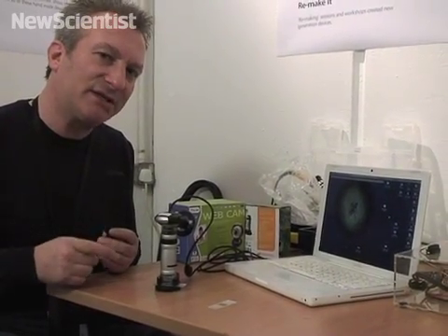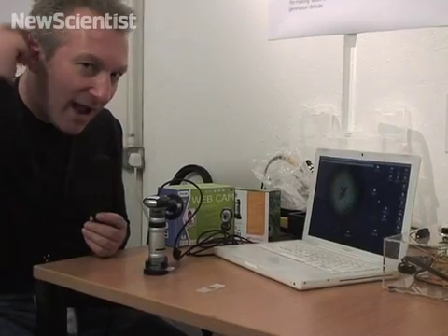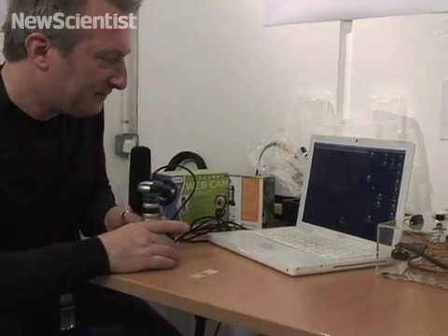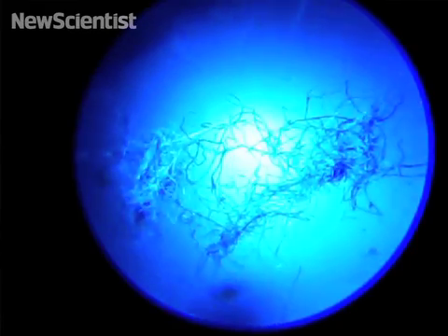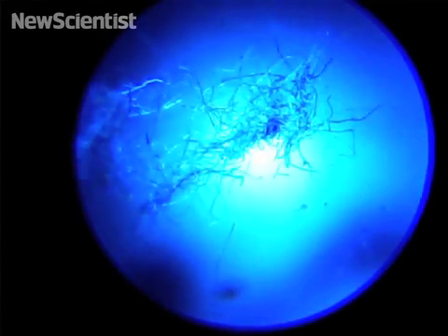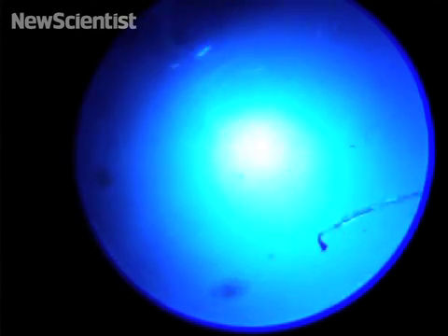So now that we've made the digital USB microscope, we're actually going to look at some things through it. Here we have some dust from the New Scientist office, and also one of my own hair follicles which I just plucked out and put on the slide. If I just move the slide, there's a selection of various floor fibers, and there, just at the bottom, you can just about see my hair follicle.